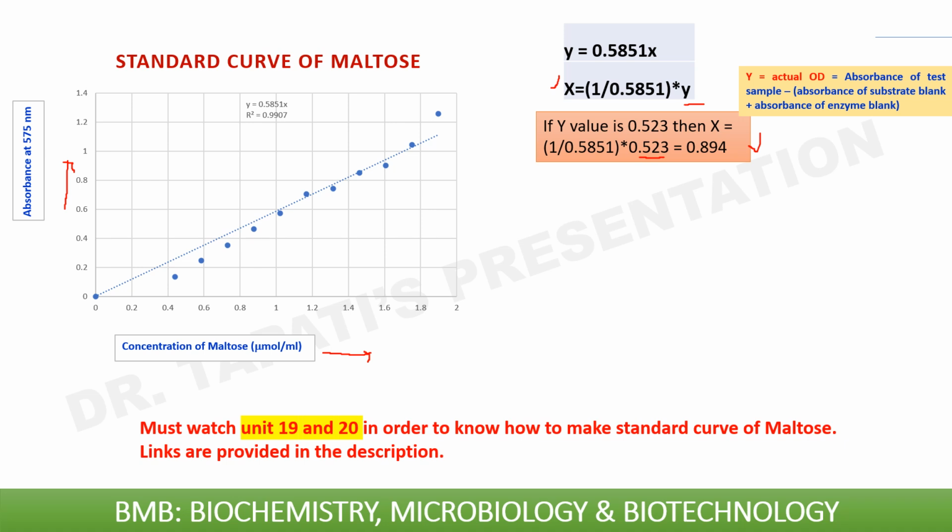The x value is 0.894 here almost, and the y value is 0.5 here. If it is the 0.5 value, then we are getting here this point.